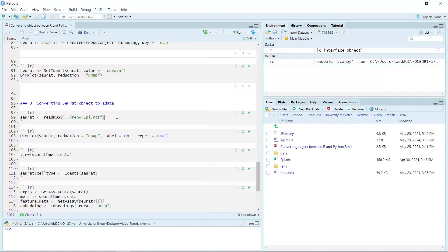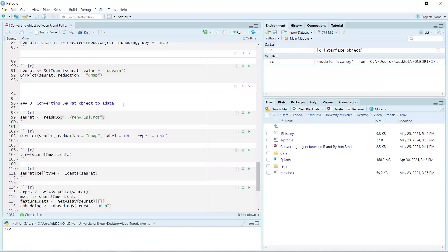In my previous video tutorial, I showed you how to set up the R environment and also convert a data object into a Seurat object. In this video, I'm going to show you how to convert a Seurat object into an AnnData object.